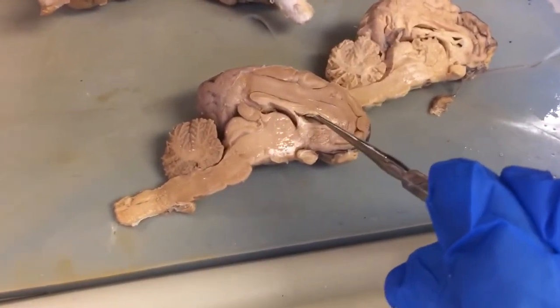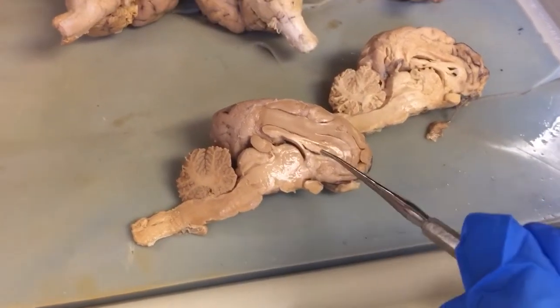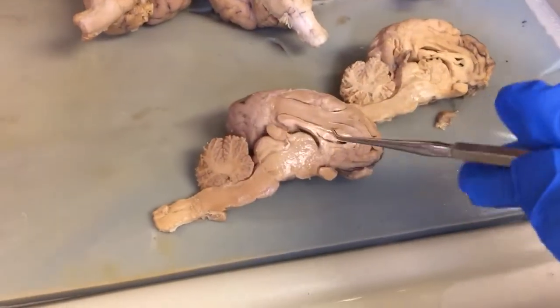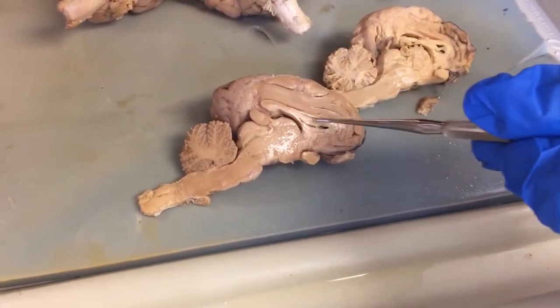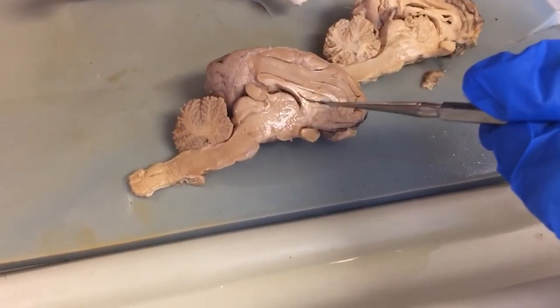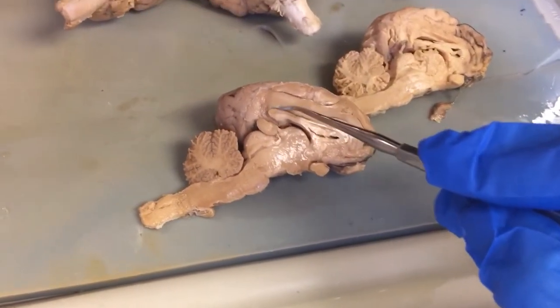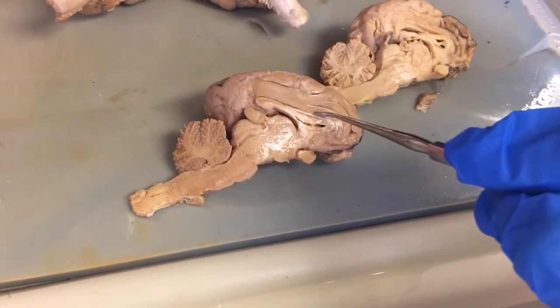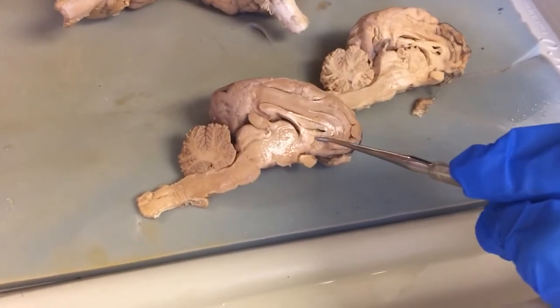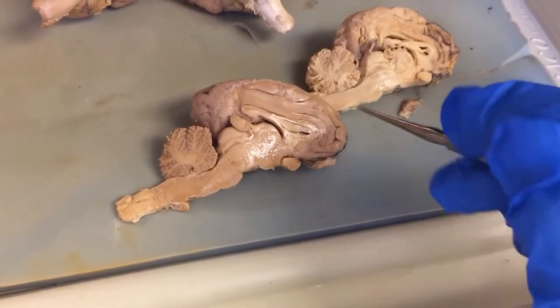Then this space here between the trunk and the fornix is the lateral ventricle, and it's got a sheet that runs right down the middle. So in some specimens you'll be able to see this sheet, and that's the septum pellucidum. Right, did I say that? Yeah, septum pellucidum. Good? All right, so I've got this whole corpus callosum, the splenium back here, the genu up here, the trunk, the lateral ventricle space, septum pellucidum, and the fornix down here. Okay, so that gives you some reference there.